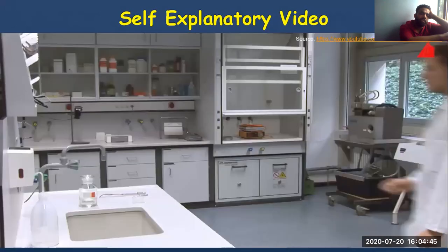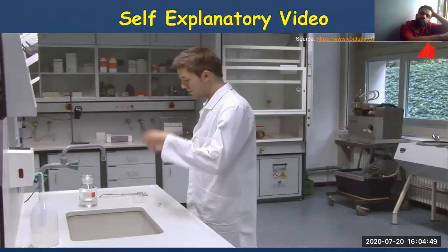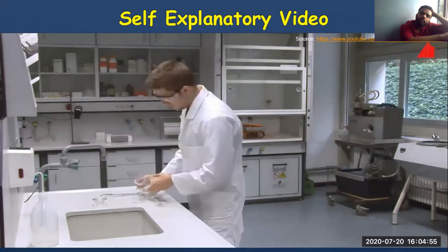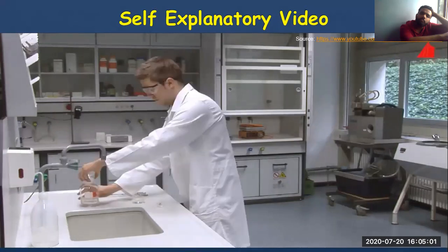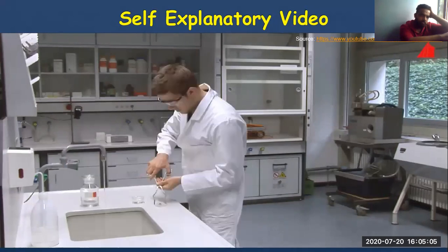To do etching, our material tester protects himself with a lab coat, puts on safety glasses, and pours the etchant into a small glass bowl. The etchant consists of a solution of 10% of concentrated nitric acid in alcohol. Now he turns on the water tap, picks up the freshly polished microsection with gripping tongs and immerses it for a few seconds into the etchant.